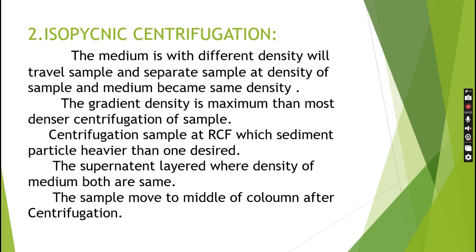Next, we are going to see isopycnic centrifugation. In this centrifugation, the samples differ in density. The density of the gradient used is not lesser like rate zonal.